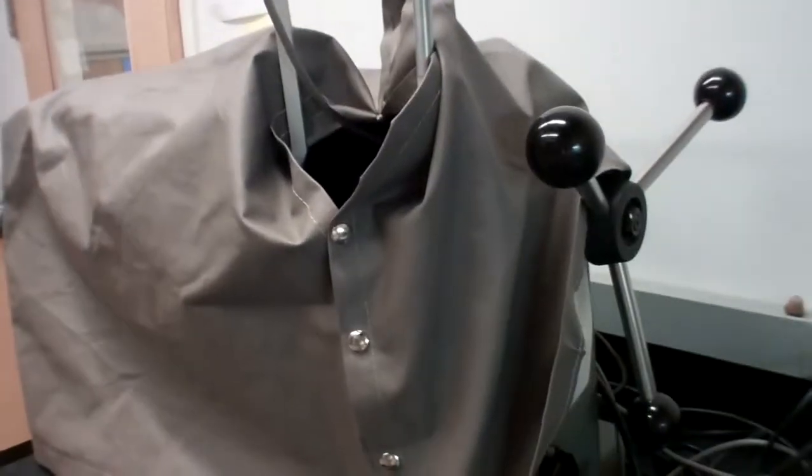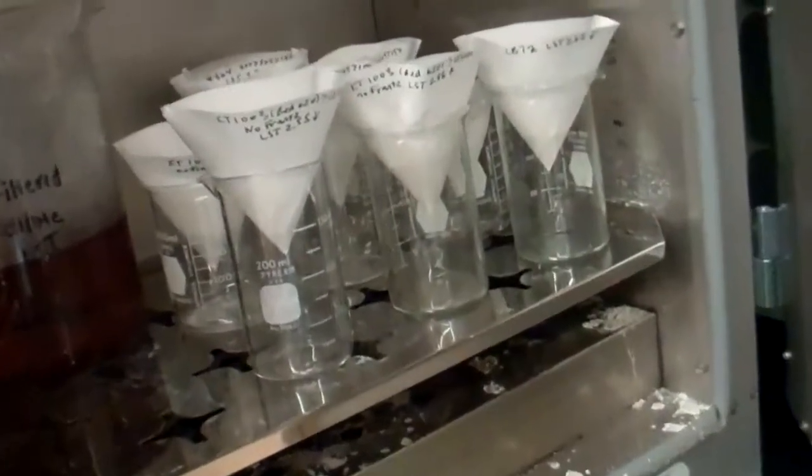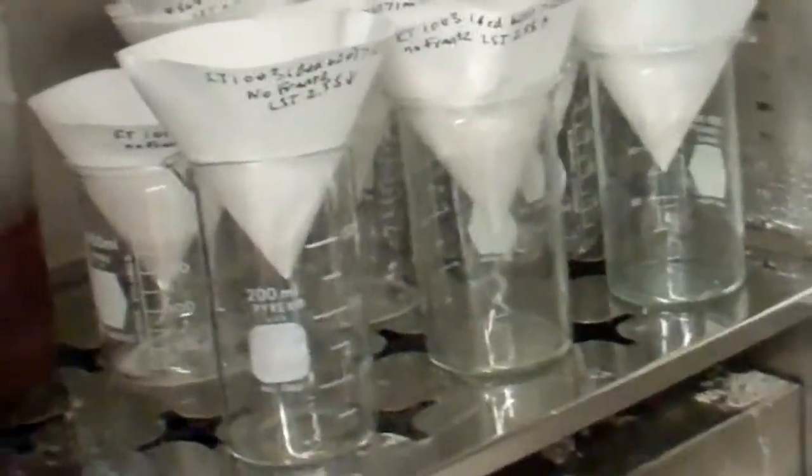Alright, so it's about lunchtime. I'm done fronzing. Franz is all bundled up in his lovely leather jacket, cleaned with methanol and air gun. Done for today. Now, check out how much I've done today. It's been quite a busy morning. I have got in the oven about eight separate samples. So actually, it was originally four samples that were separated into sinks and floats, and now they're drying out. And as soon as they're all dry, I will bottle those up into tiny little vials, which will be stored and looked at under the microscope later. So, quite a busy morning.